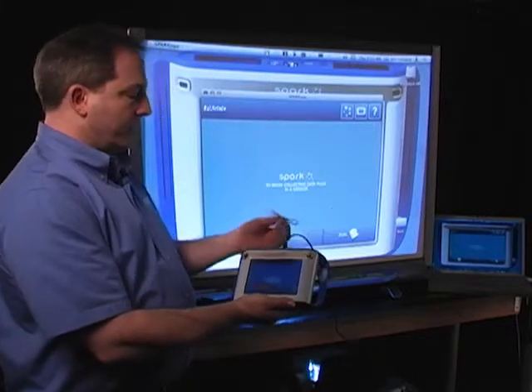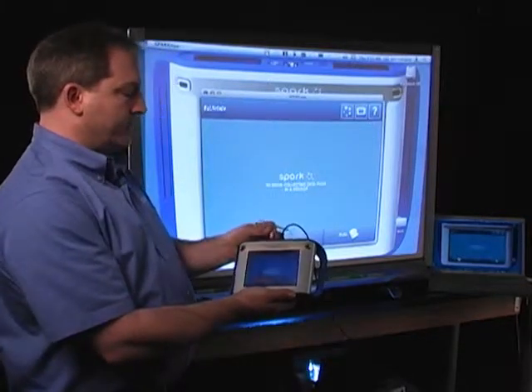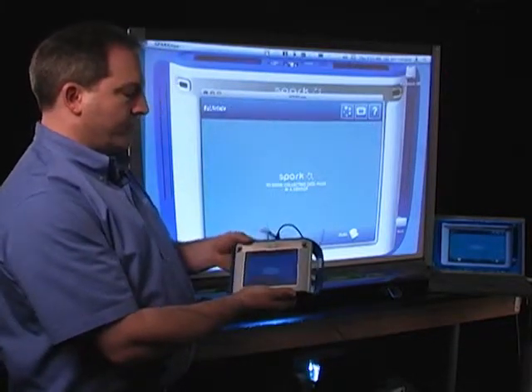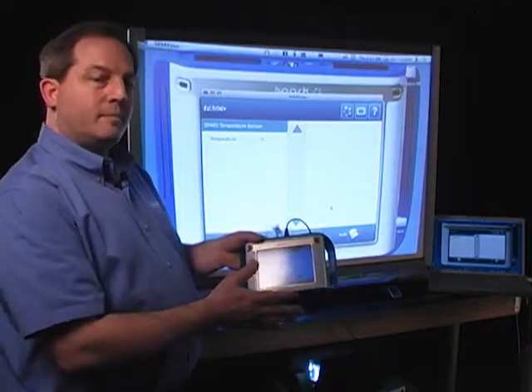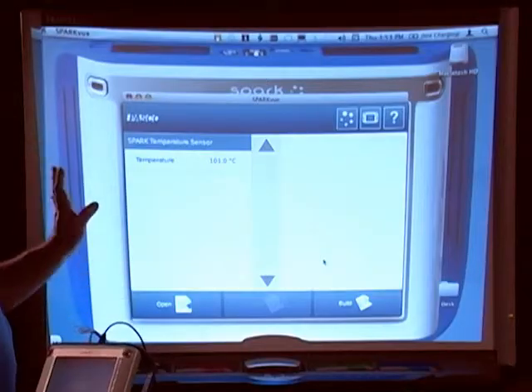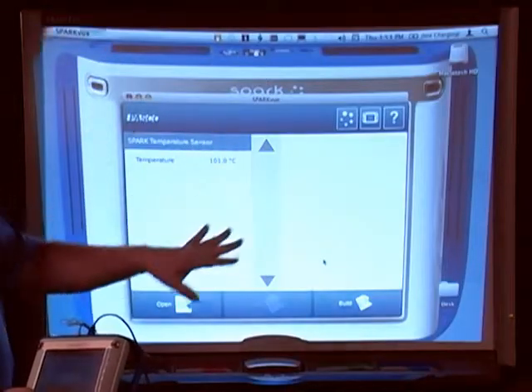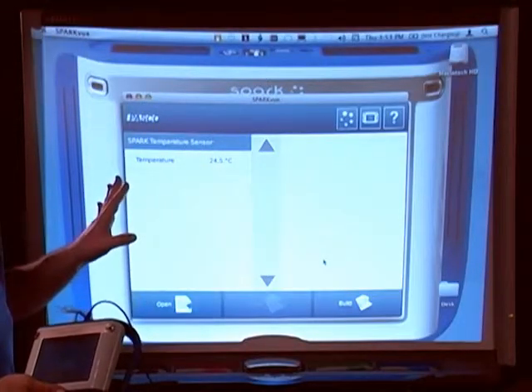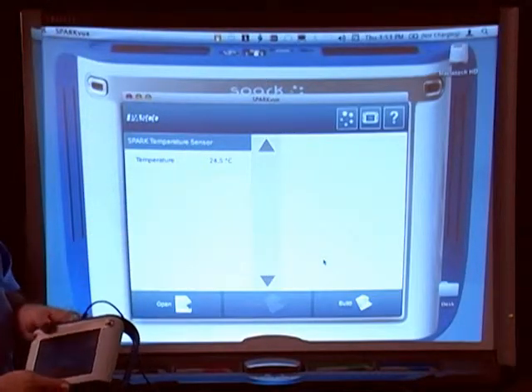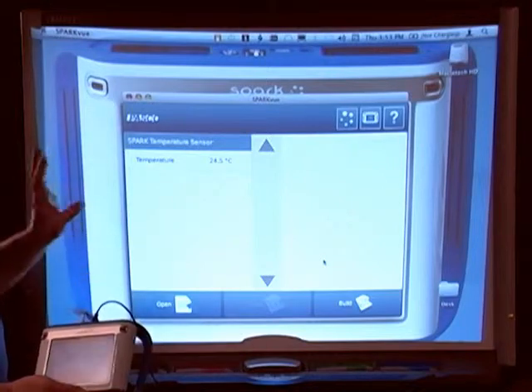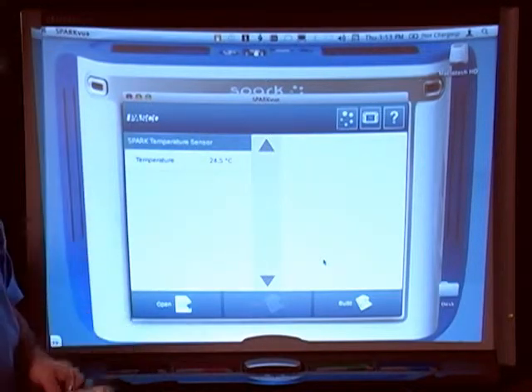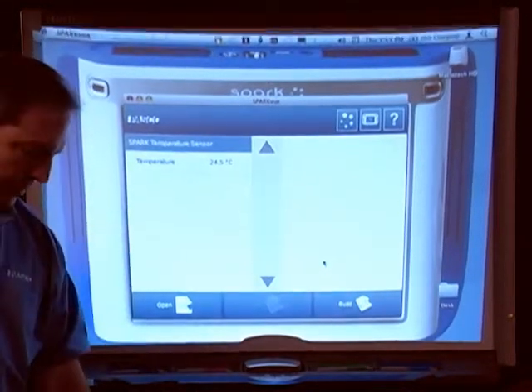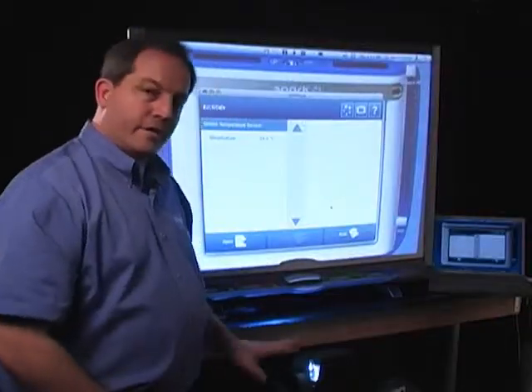To demonstrate, I'm going to go ahead and connect a sensor. And you'll see that my screen here remains the same. But up here, it does exactly what I expected to do with the Science Learning System. I get the measurement and all the information that I would normally get on the device.